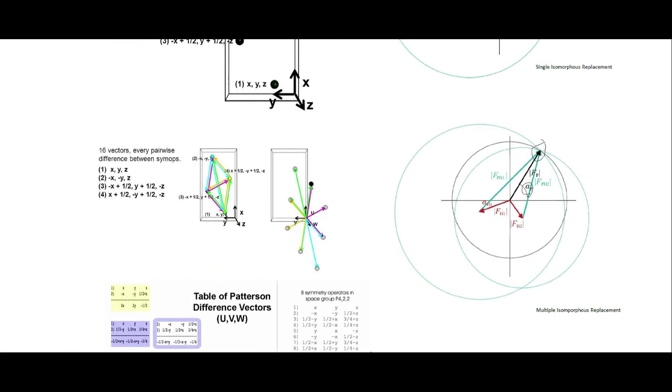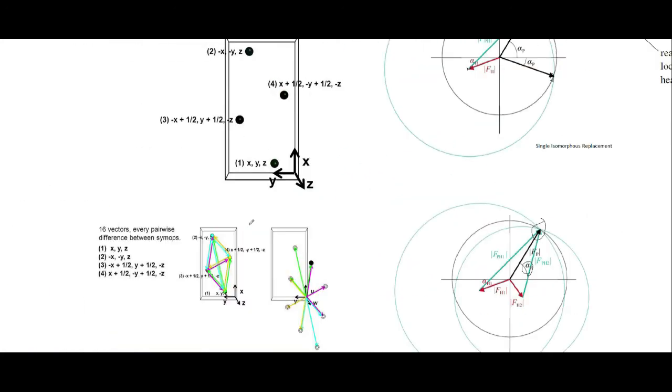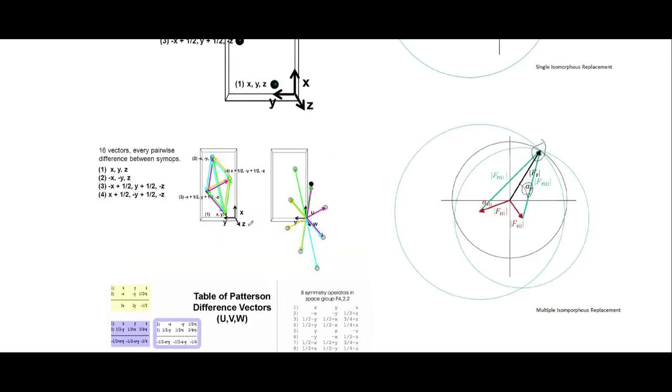This is one of those things I was debating about going through: this idea of the Patterson function and the Patterson maps, and the Harker planes.